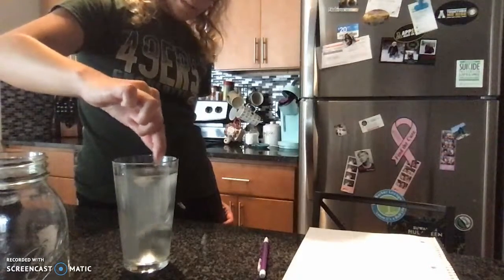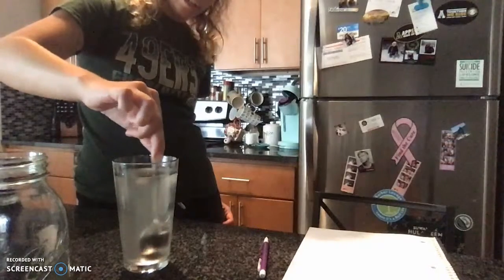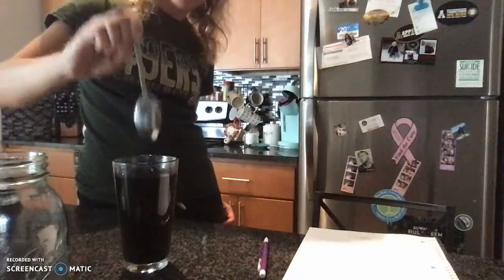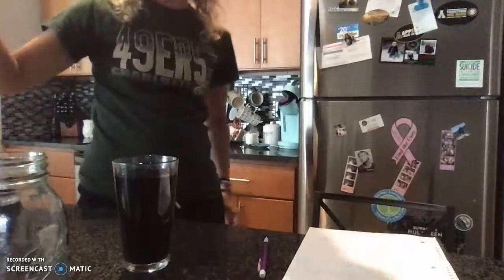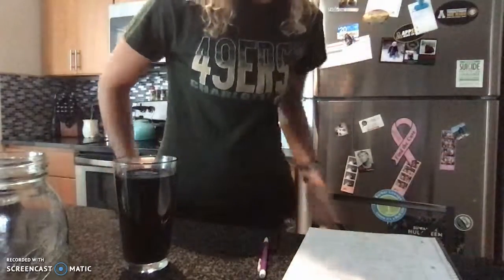Now when I used it, it changed pretty quickly for me because the temperature of the water was a lot, there it goes. The temperature of the water was a lot hotter. But as you can see, there's the solution after equal parts are mixed together, creating that blue-black color. So that's the iodine clock reaction. I hope you liked it. Thanks.